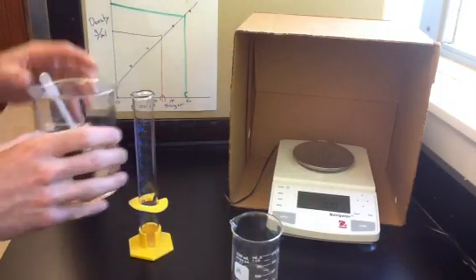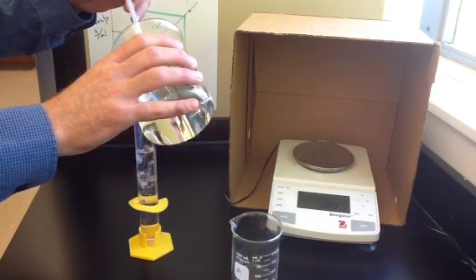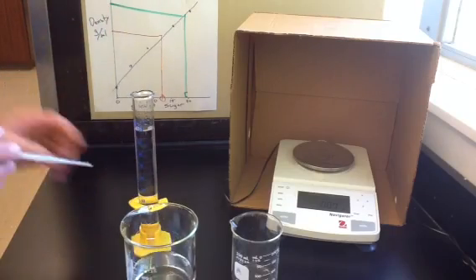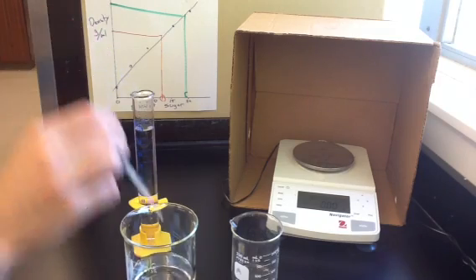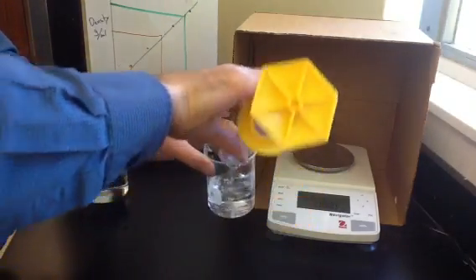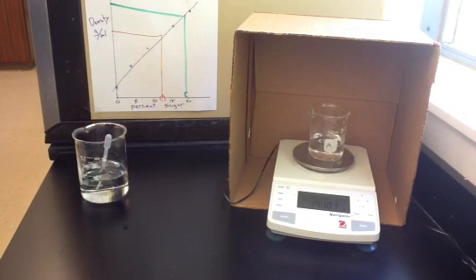Now, this is just tap water, this has no sugar in it, so this will be for our 0% solution. And we're going to measure out as close to 100 milliliters as we can. The density is not going to vary a lot between the different solutions, so we want to be as careful as we can with our measurements. We'll add a few more drops to get the bottom of the meniscus right to the line for 100. And we'll pour this into the beaker, and we'll find the mass of 100 milliliters of tap water. And we get 191.00.